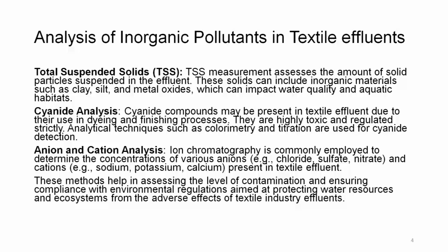Cyanide analysis. Cyanide compounds may be present in textile effluent due to their use in dyeing and finishing processes. They are highly toxic and regulated strictly. Analytical techniques such as colorimetry and titration can be used for the analysis of cyanide and their detection.